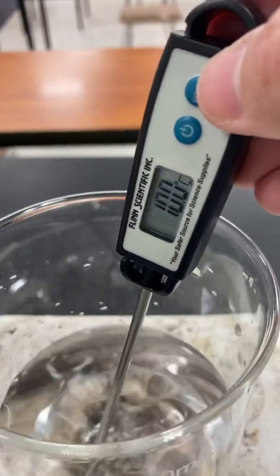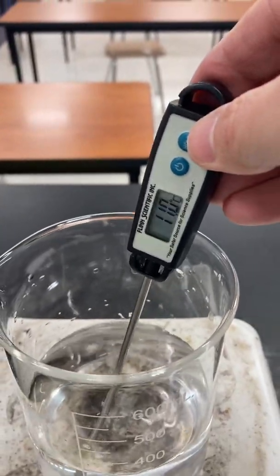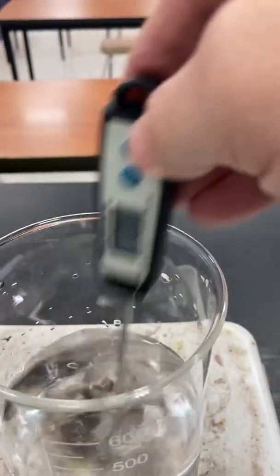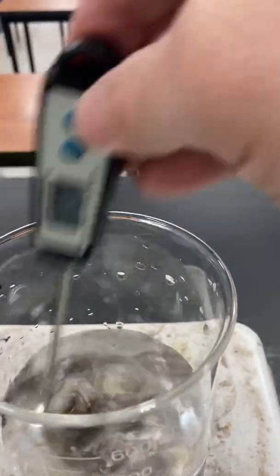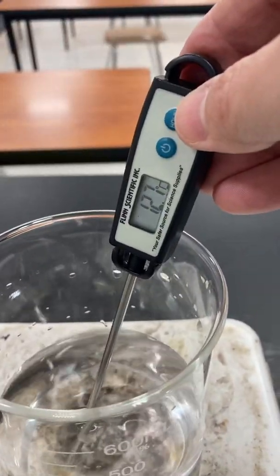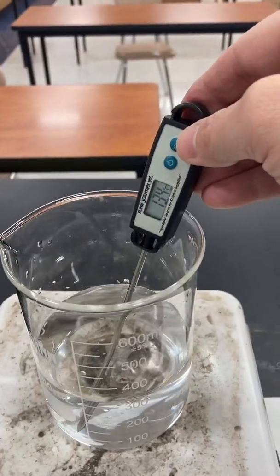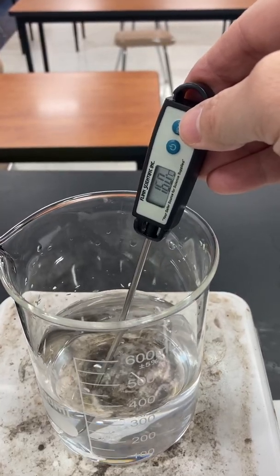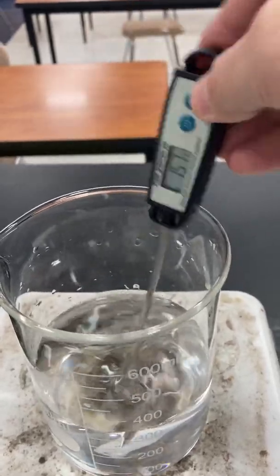Another 30 seconds later. It's important to try and stir this. Now we're at 14.8 degrees Celsius. Whoa, it already jumped up. So at 4 minutes, we were at 14.8.